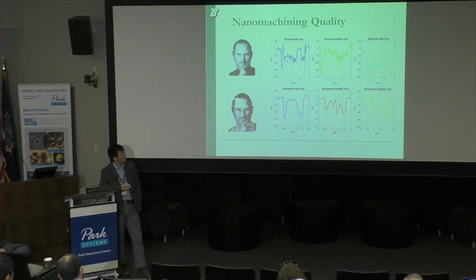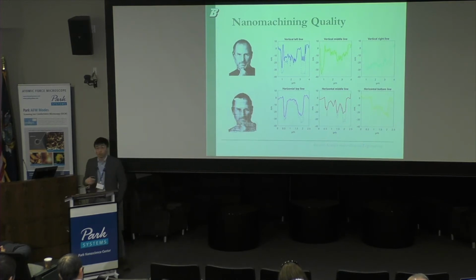So this one conforms very well in terms of this deep change. But the very high frequency change, it has a little bit different stuff. You can see there are some differences in terms of the quality. Okay, so one reason is what I just talked about, the tip. The vibration limits the resolution.